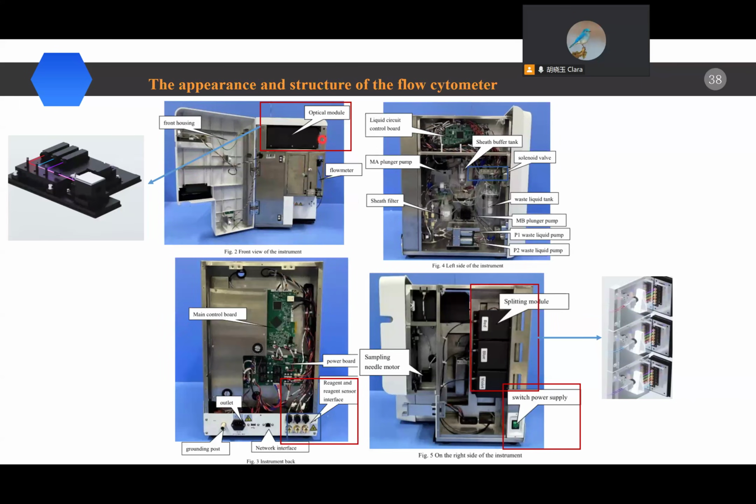Okay. Here's the optical module like this. And then the tongue and so on, and the reagent sensor interface where we connect the reagent. And here's the splitting module, where we split the signals, and the switch power.